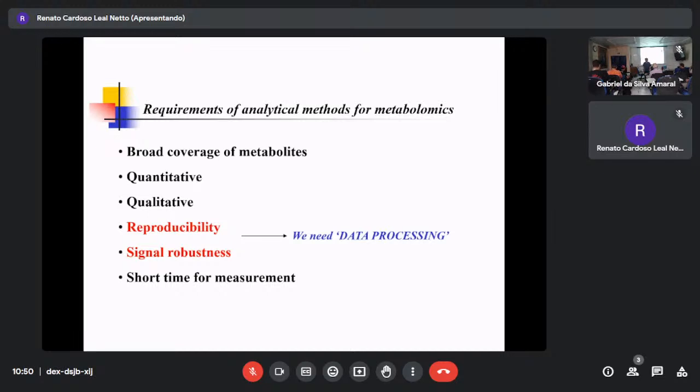Very nice. From the quantitative is a concentration. Qualitative means from the signal, can you guess the structure? Is there a potential or not? With MS, molecular weight 300, then it's easy. Why? Because you can look up in Google or some database and flavonoid comes out. It's qualitative. Based on data, whether there is a possibility to know the structure or not. MS is one. NMR, 7 ppm or this one, to know the structure.